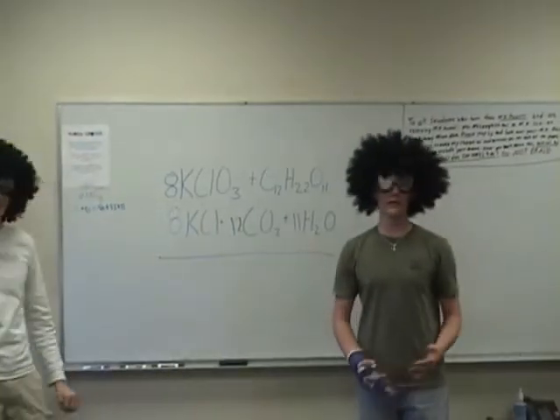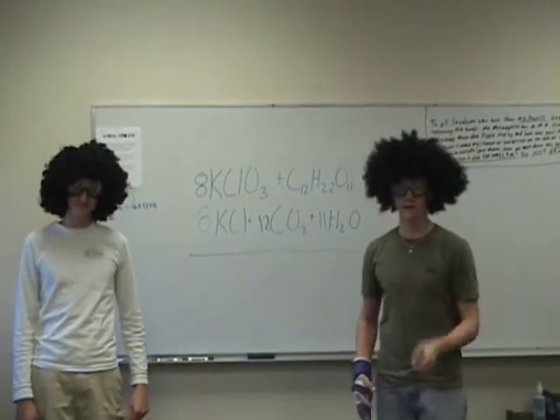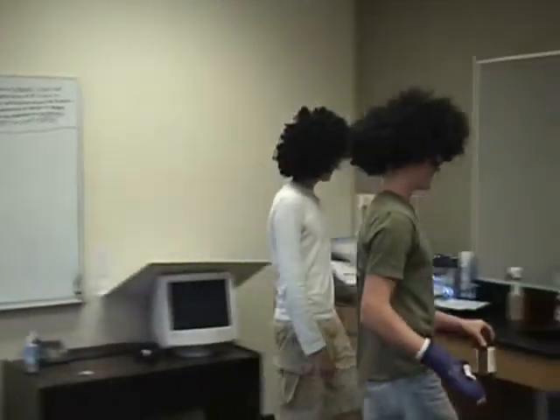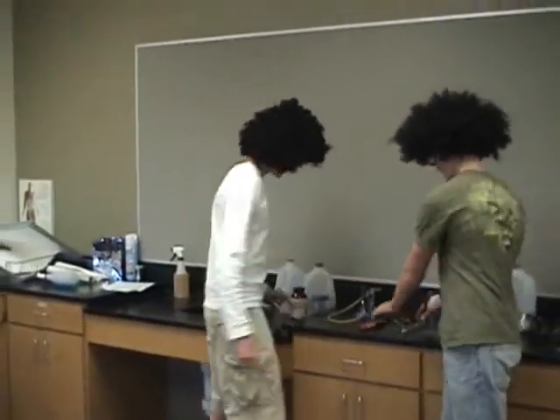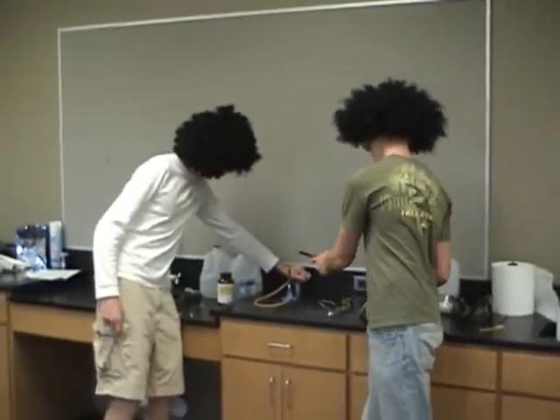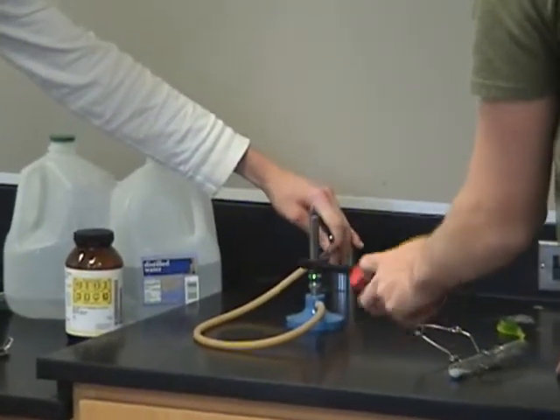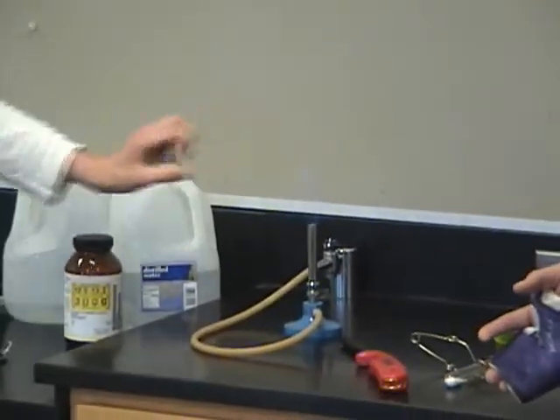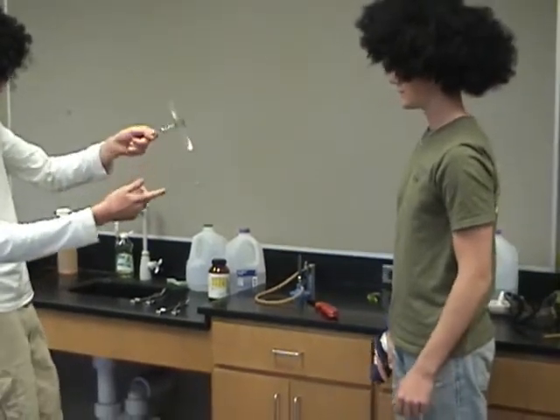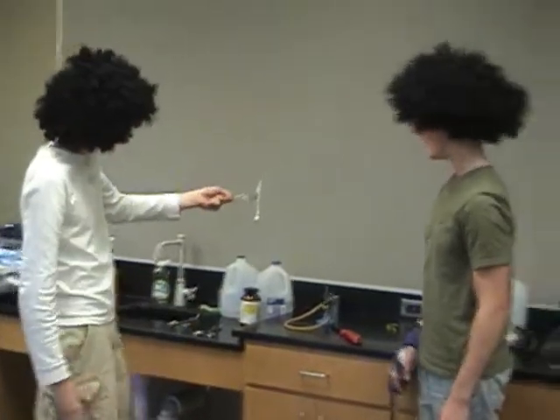So now we are going to begin our experiment by lighting the Bunsen burner. Be very careful — you can get burned. And please do not try this at home. Begin with the lighter, turn on the gas, get it about yay high. Now we have a steady flame, and we are going to melt down our potassium until it is molten potassium chlorate.